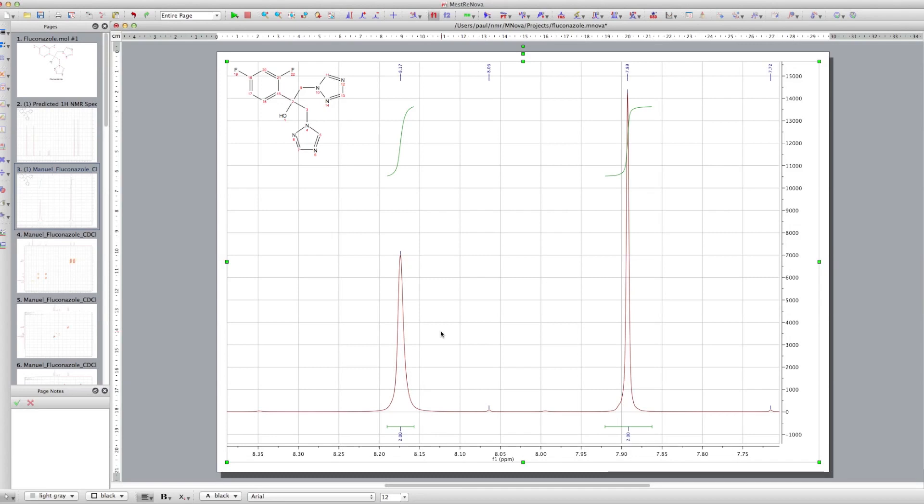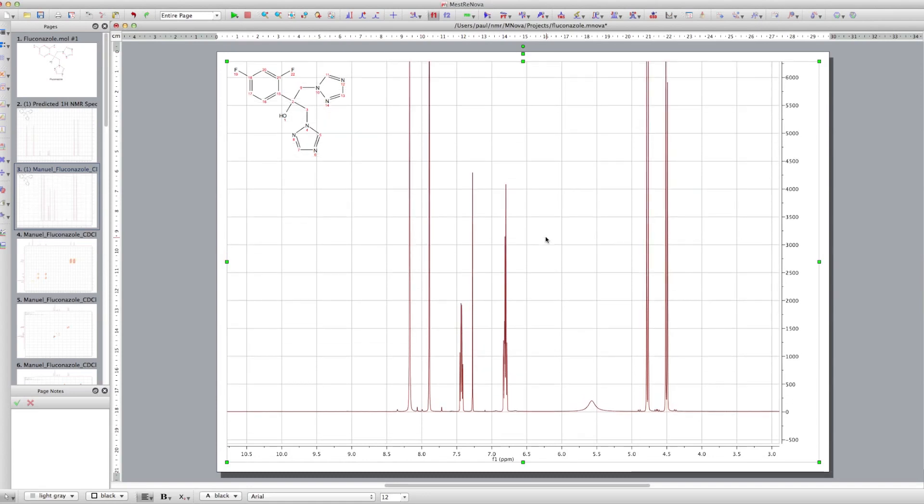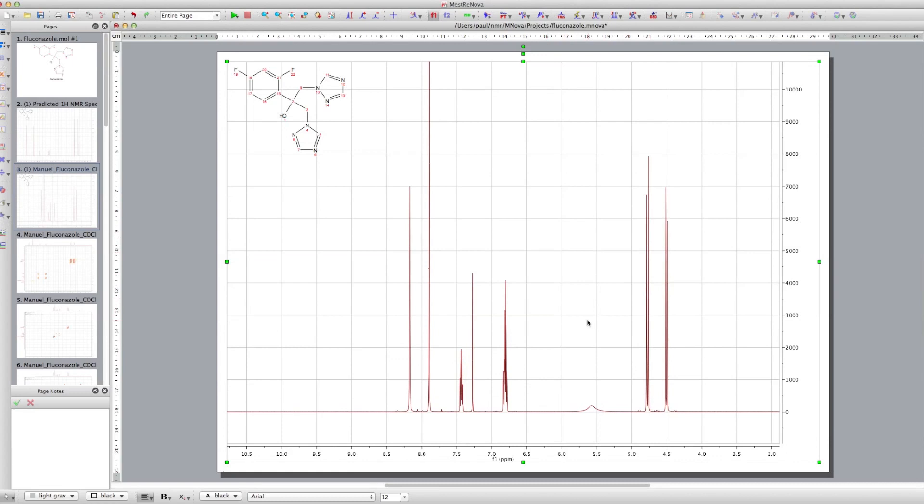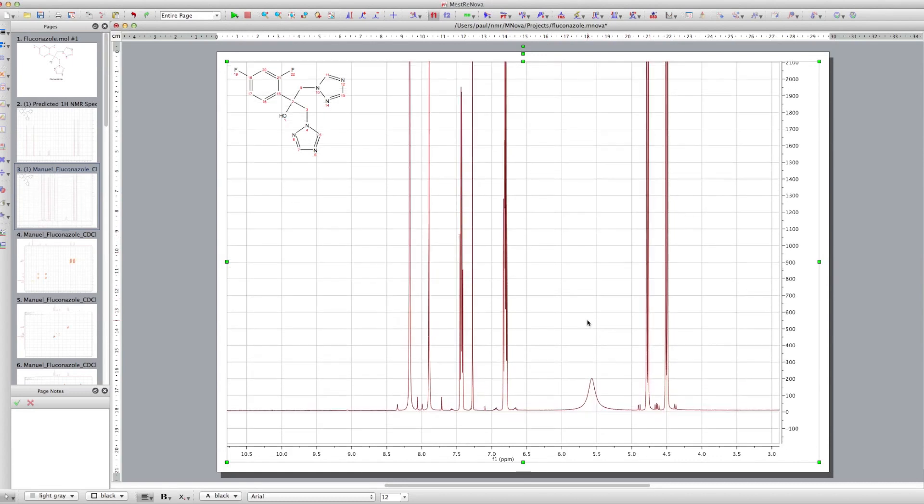But if you do the integration, the peak area is the same, even though the height's different. So don't be put off by having these nice high peaks and short peaks. And we'll have a look at the relaxation properties of these protons in future tutorials.